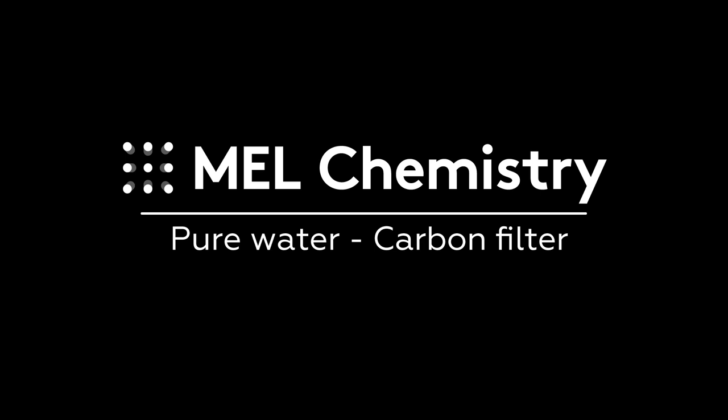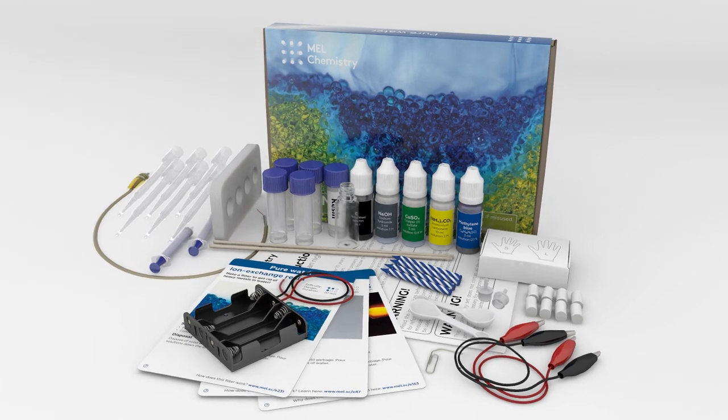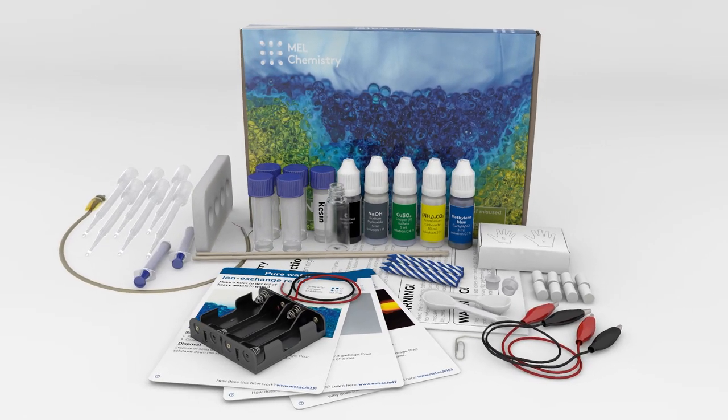Welcome to the wonderful world of chemistry. Today, with the help of the Pure Water Set by Mel Chemistry, we will purify water with a do-it-yourself carbon filter.